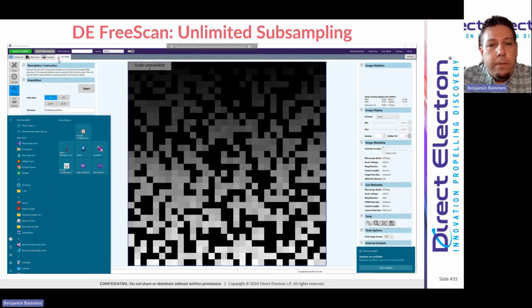So it's a way of adding subsampling to any experiment or any scan pattern, including the XY files that you load. I'll mention that if you want even more control over subsampling and you want to specify your own specific subsampling, you can do that by defining it in your own XY file, in which case you would ignore the subsampling box. This subsampling box is really just a way to make this an easy process.